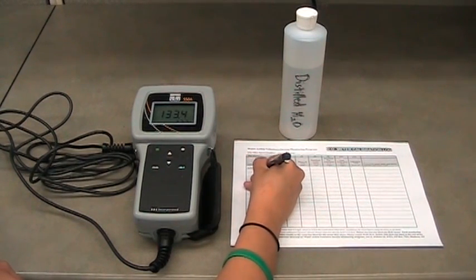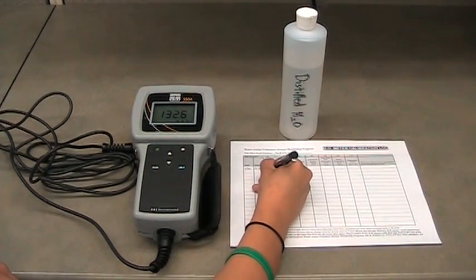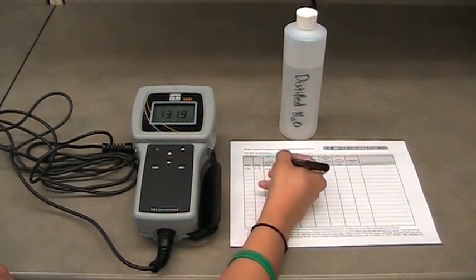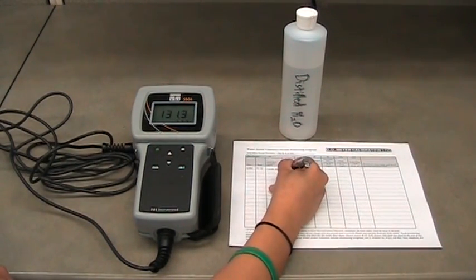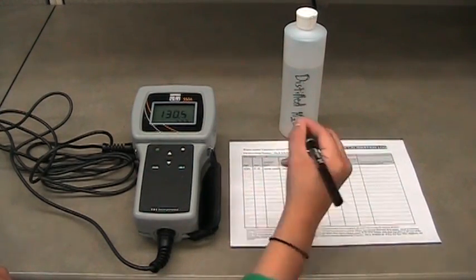Record the date, time, name of volunteer or individual calibrating the meter, altitude of your current location, and warm up time for the meter on the dissolved oxygen calibration log.